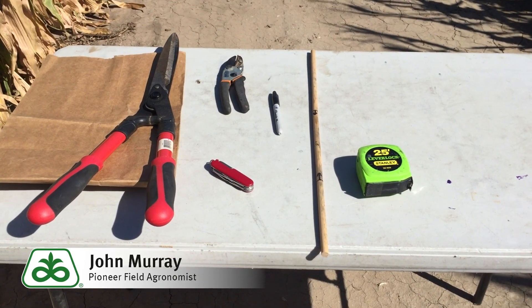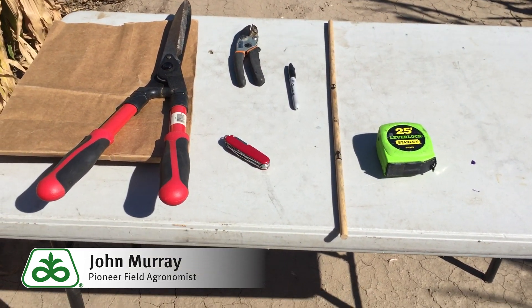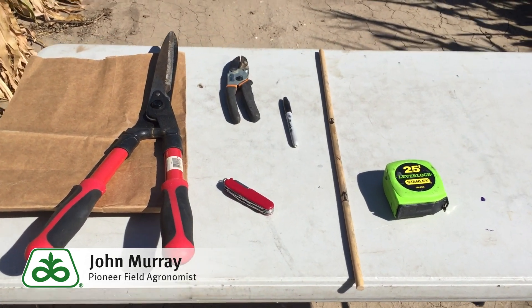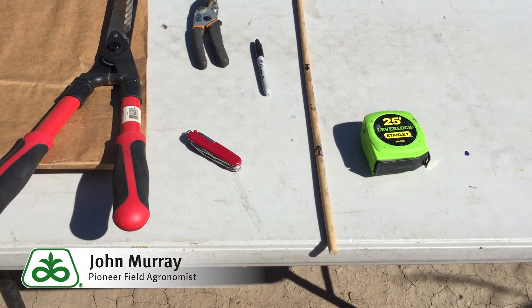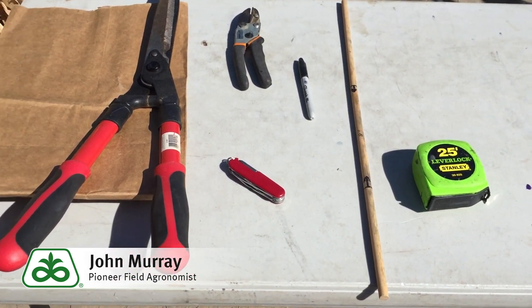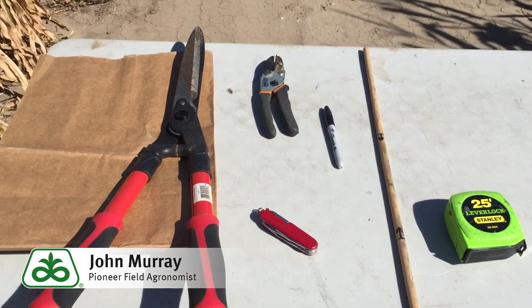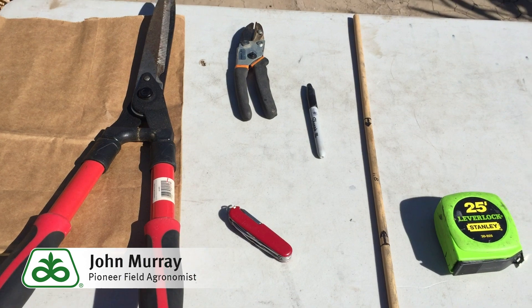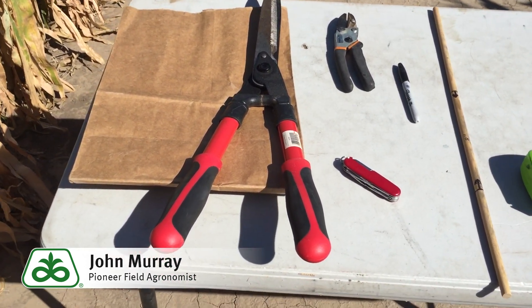Before I demonstrate how to run the corn stalk nitrate test, I want to show you some of the equipment you might use. First of all, you need something to measure with — a pre-measured stick or a tape measure. You'll need something to cut the corn stalks with: it could be a knife, hedge shears, or small trimmers. You also need a marking pin, and once you collect your stalks, you place them in a paper bag.